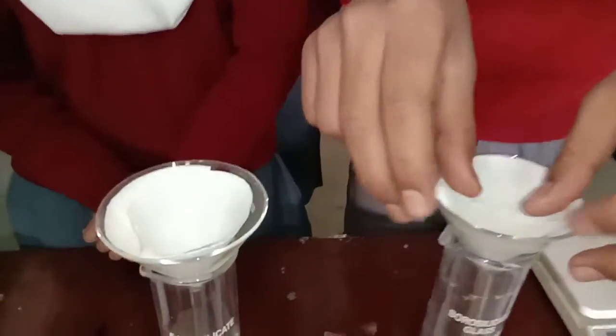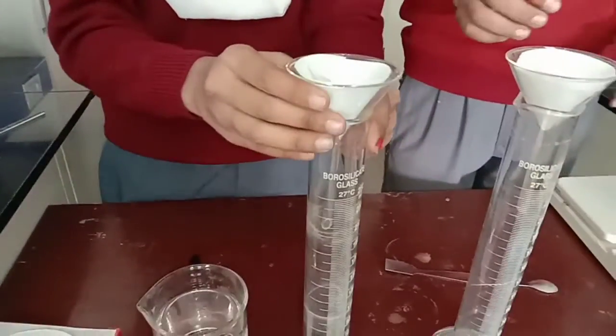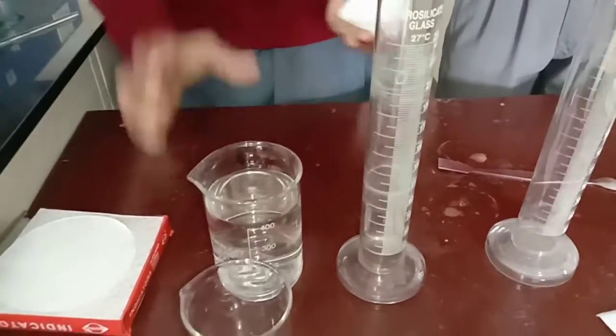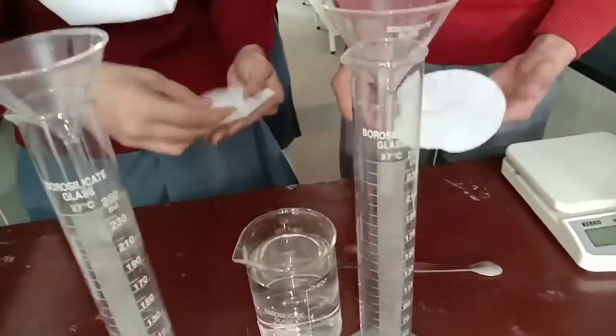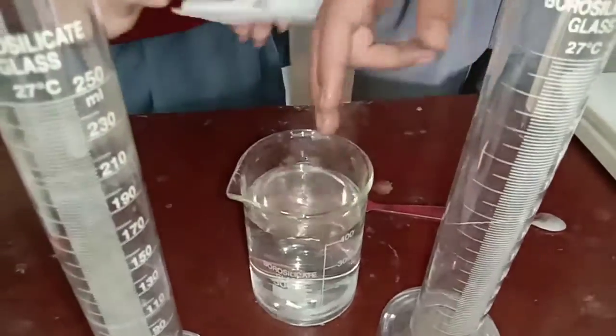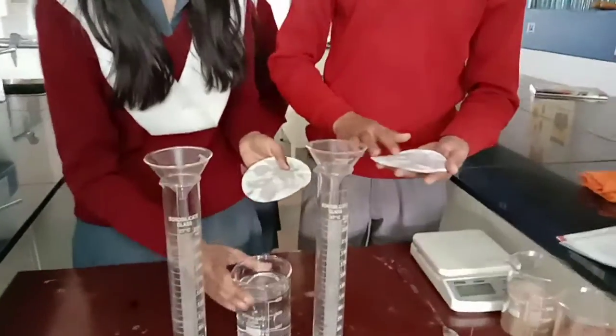Here we have to find the water holding capacity of the soil. So if we directly keep the filter paper like this, then this filter paper may absorb the water. So to avoid this, we'll put some water over the filter paper.